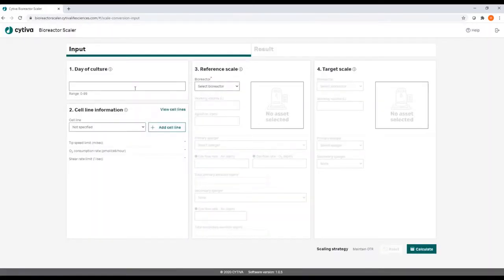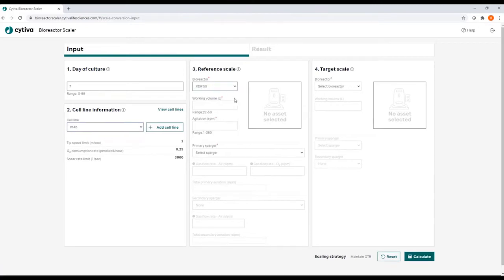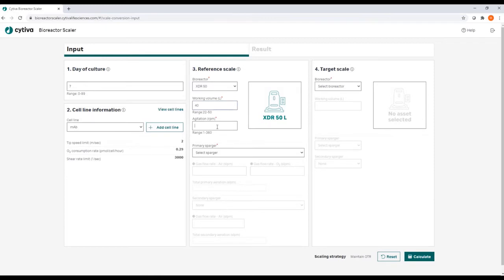You then come to the input page where you enter the day of culture, some information on the cell line, like the shear limits, and then you define the bioreactor scale you are scaling from, the reference scale.